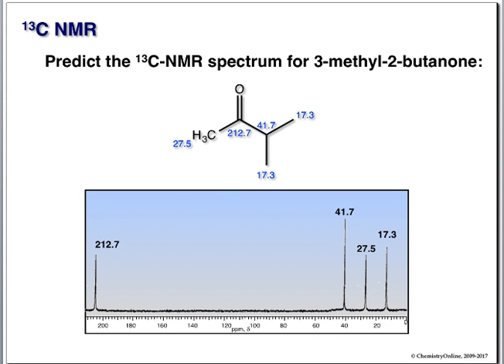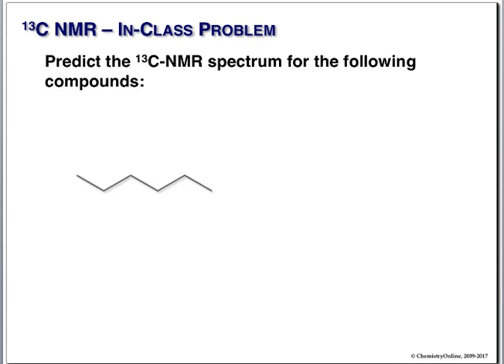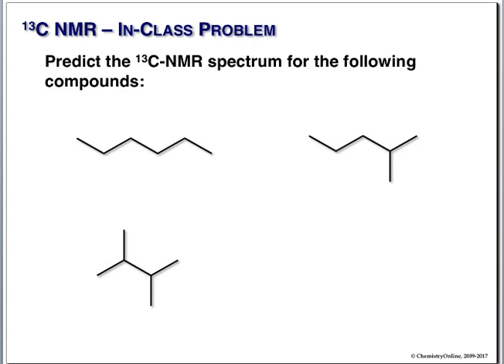If we did this backwards, not knowing what this is, we would look at this spectrum and say, okay, clearly we have a ketone carbonyl. We have 3 other types of carbons. This is either crowded or it's next to there, and this is a simple. So that's the kind of information we get just directly by looking at it. Let's go ahead and look at some compounds and try to predict more or less what we might expect in the spectrum.